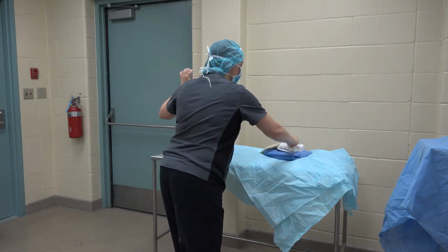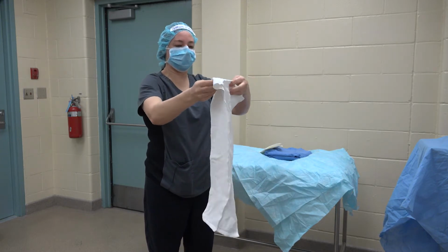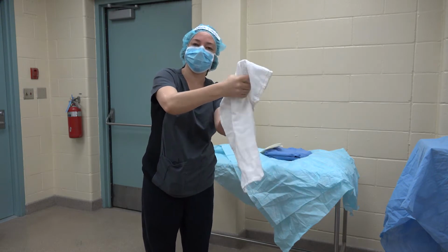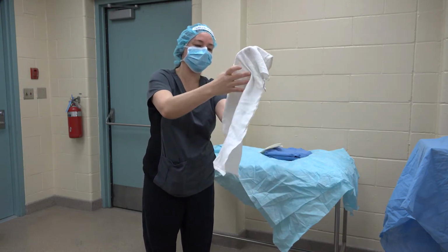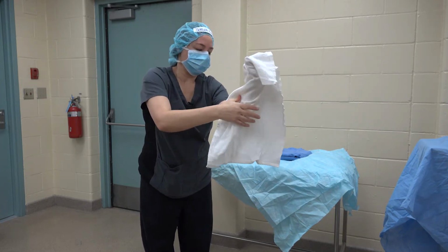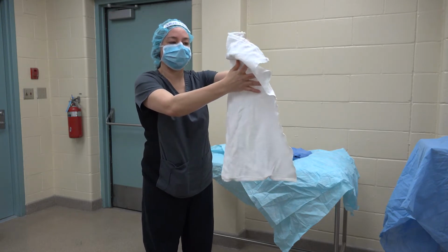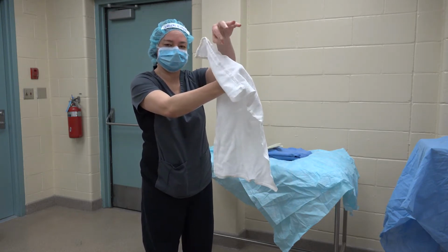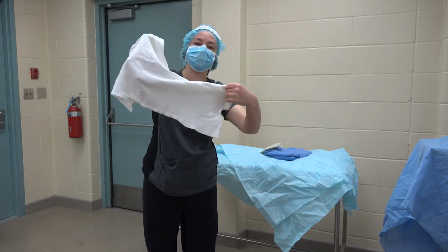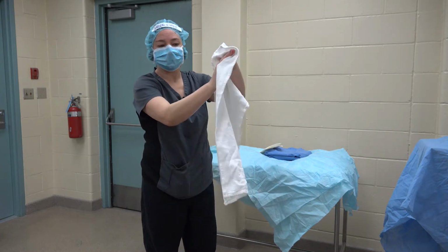So I'm going to pick up my sterile towel, shake it out here. The first thing I'm going to do is dry my left hand, because I'm right-handed. So that's the easier hand to dry. I'm going to work the towel down towards my elbow like this so that my hands are dry. Then I'm going to rest it on my right hand, okay? Pick up the end down here because I didn't touch this end yet, so it's still sterile. Flip it over, and now this is still the sterile side.